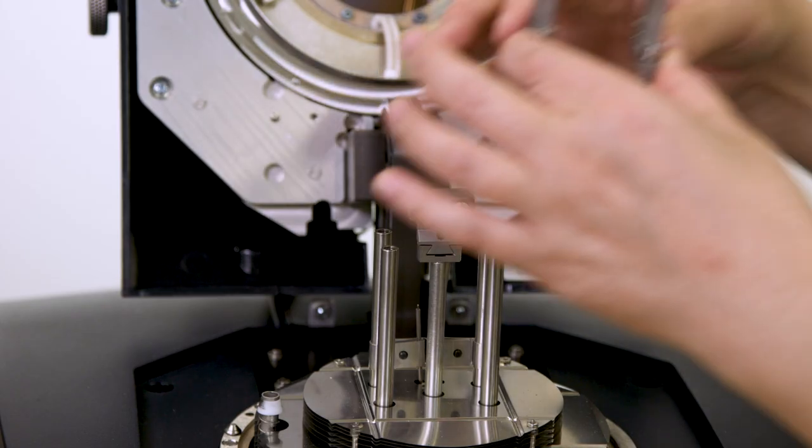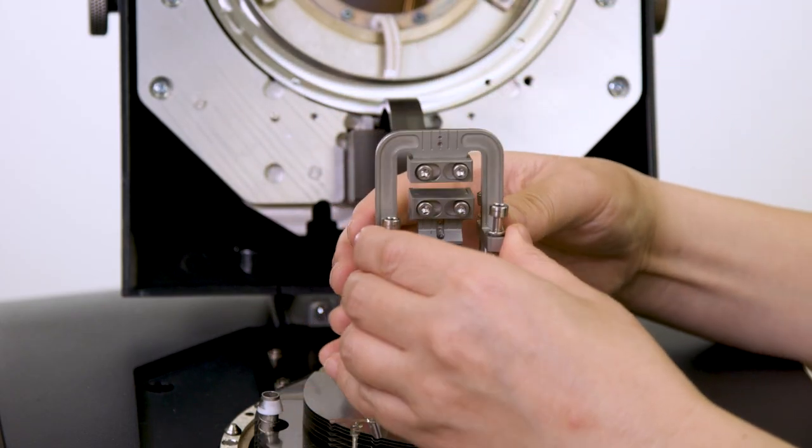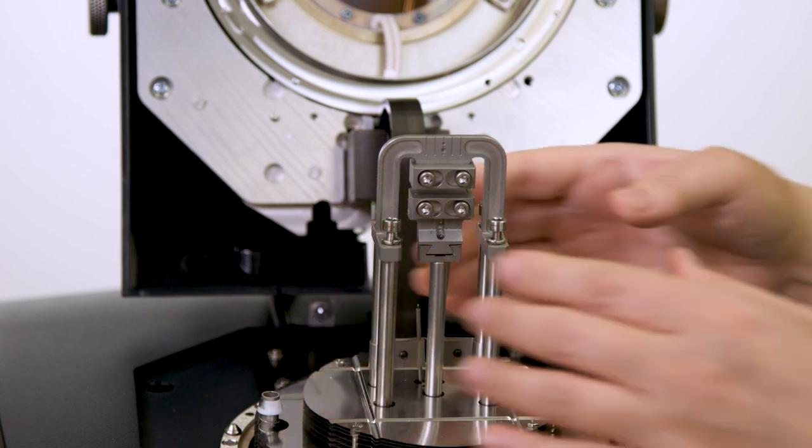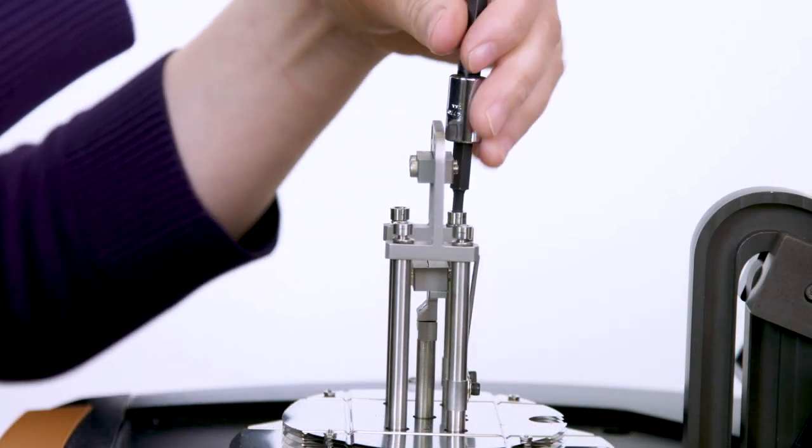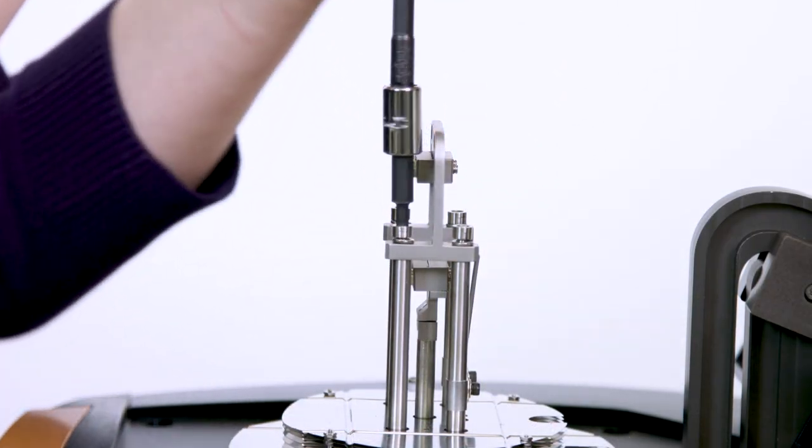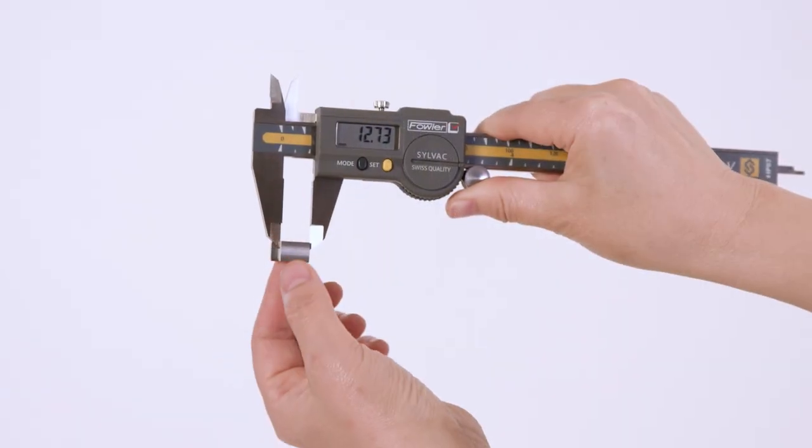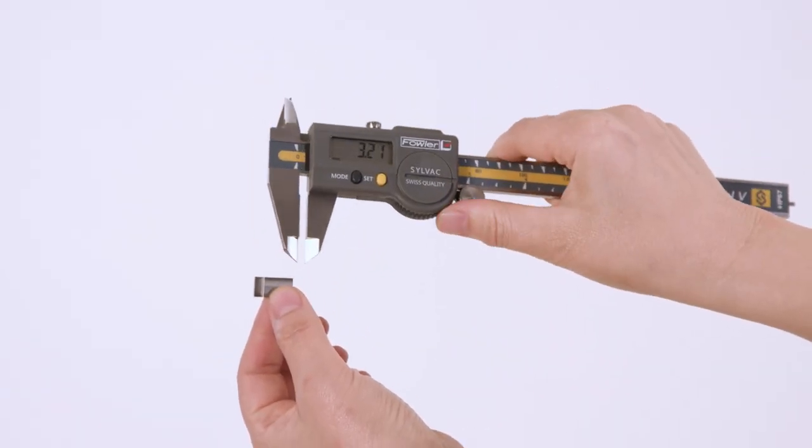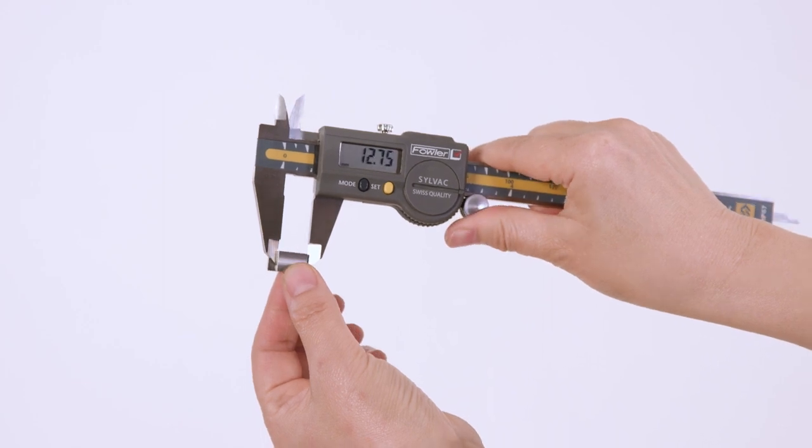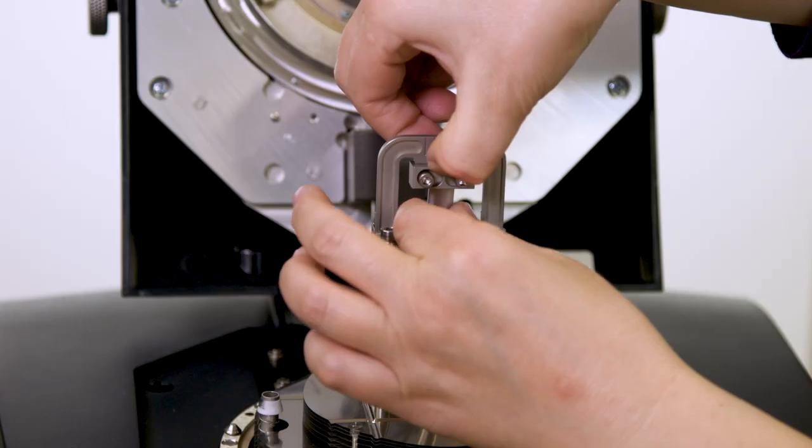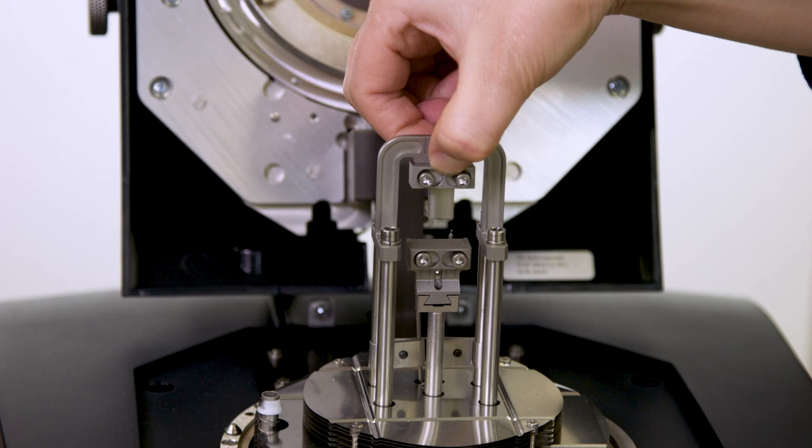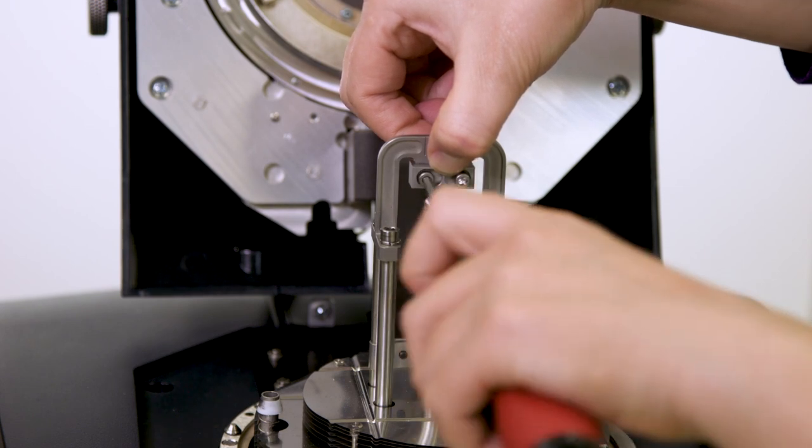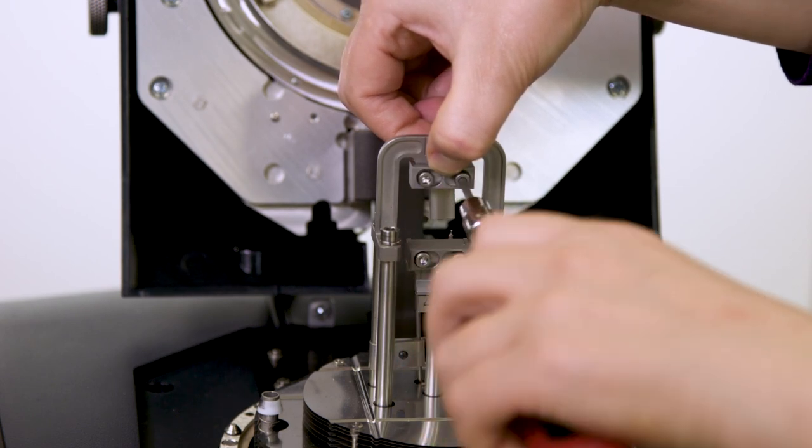For clamp offset calibration, install the fixed clamp onto the four posts. Tighten the screws with the torque wrench set to 10-inch pounds. Find the offset gauge sample from the clamp kit. Using a caliper, measure the length of the offset sample. Then, mount this sample to the upper clamp using 3-5 inch pounds torque.